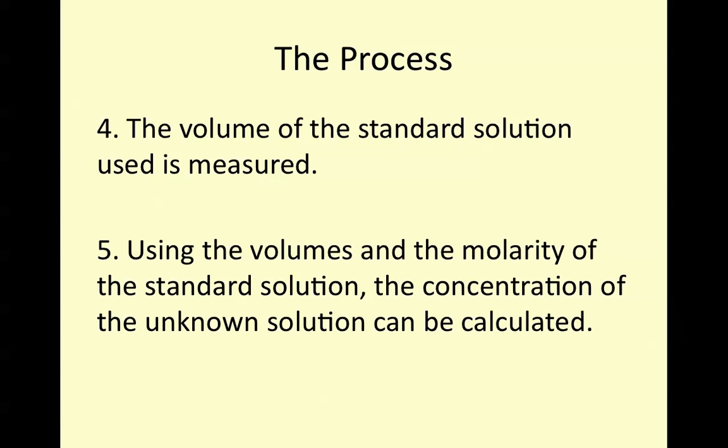So this would be a great thing where if I go in the back of the closet and I see that I have a bottle of an acid with an unknown concentration, I could use a titration process.